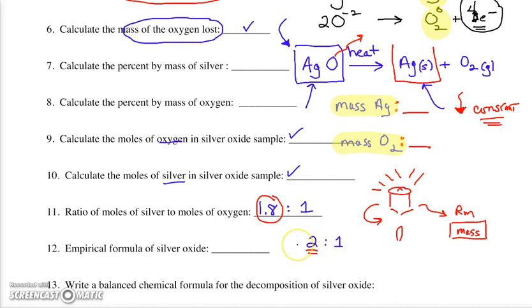Now we know if we were to do this lab hundreds and hundreds of times and you got better at the technique, probably this number would quickly approach 2. But doing it once or twice, you don't have the technique down or the confidence in yourself to get really accurate data. It takes time, and we just don't have time to do it that many times. But that's what they were doing in the 1860s, doing these over and over and over again just to make sure that we got whole numbers. And of course, these whole numbers were verifications of whole number differences in atoms. And of course, we built our empirical formula based on these ratios.